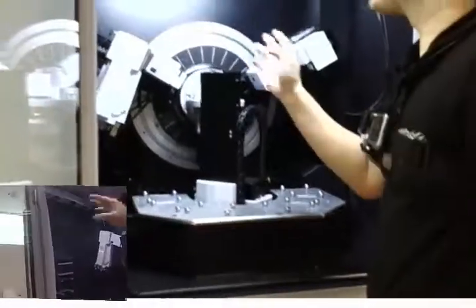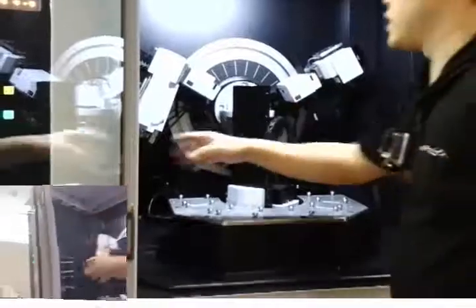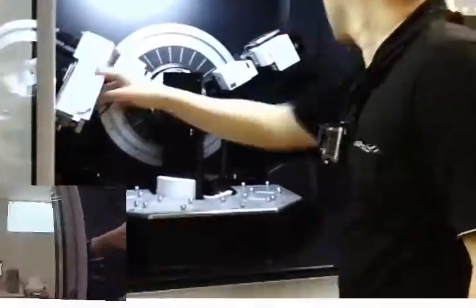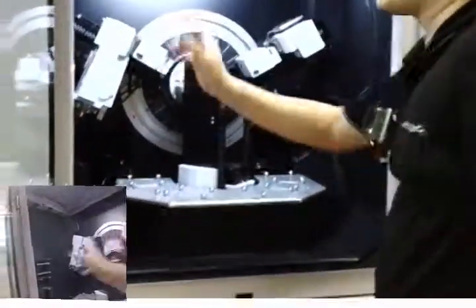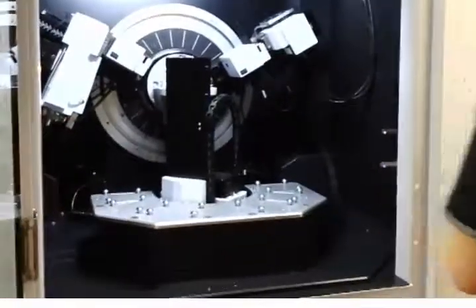For this enclosure, it's very good because there are two mountings for you to put some of your accessories — your sleeves and other accessories — right here on the sides.